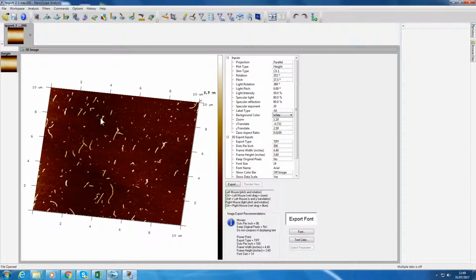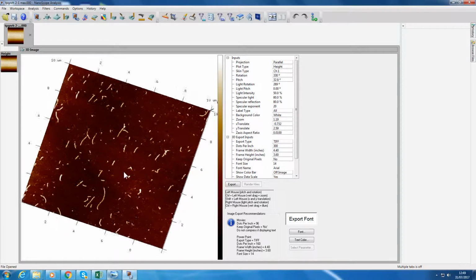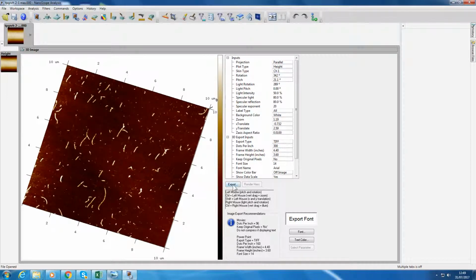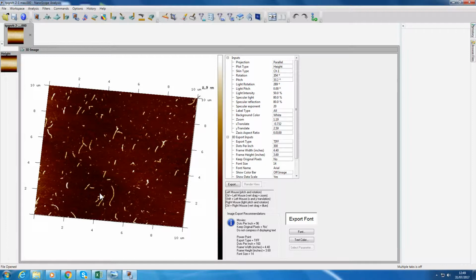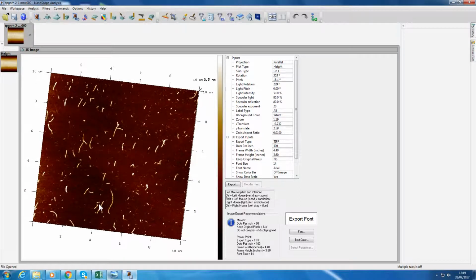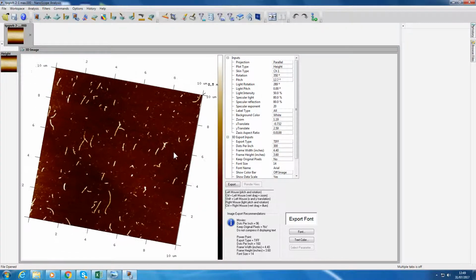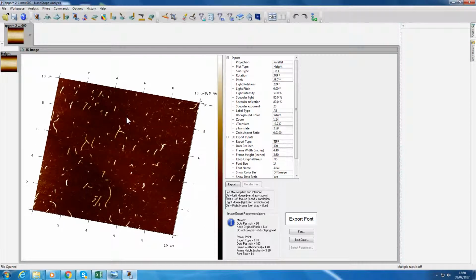And we can move the image around with the left mouse button. You can see when I do that, the numbers and the image go outside of this image area. So if we were to save that using this export, we'll be chopping off these numbers, so that's not good. So we can rotate that round, get the angle we want, the orientation, and we can see that here, rotation and pitch. And then so it doesn't truncate it here, we can use control and left mouse button, and that just zooms in or out, so we can get it just in the right space.